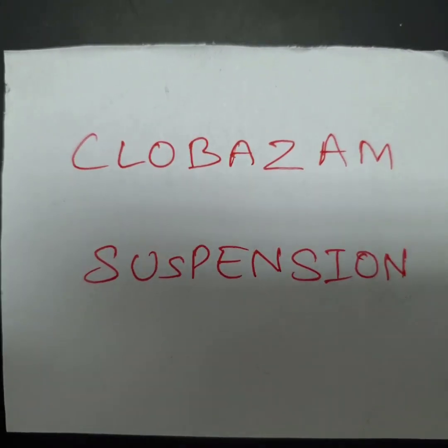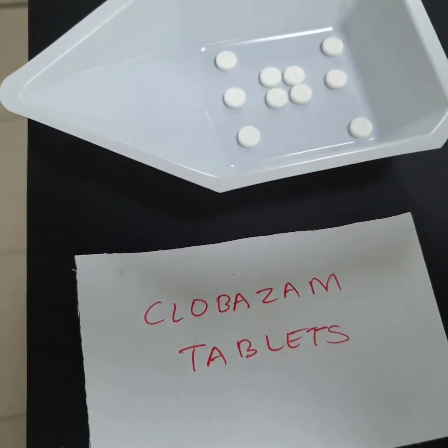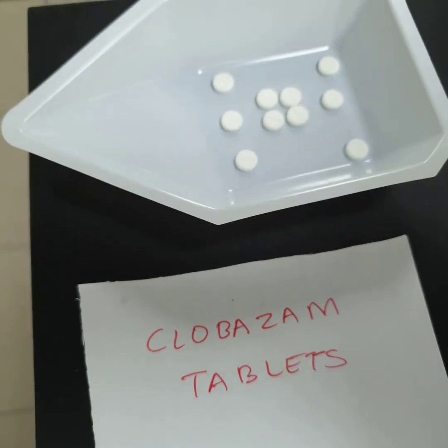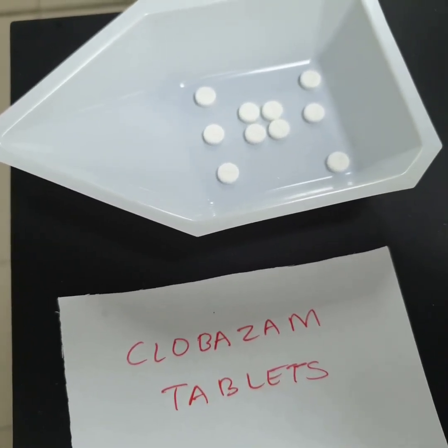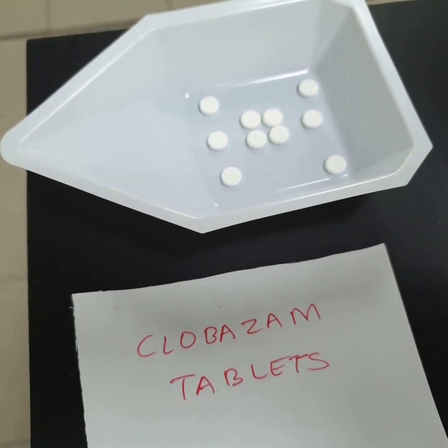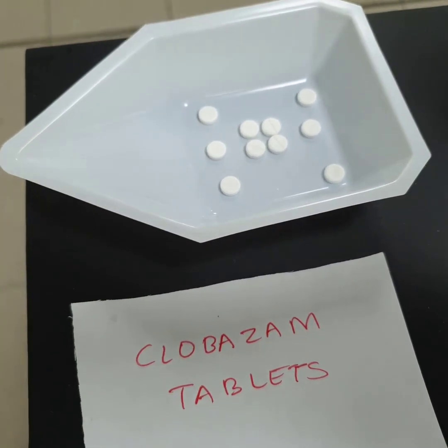Now I'm going to show you all the ingredients, glasswares and tools which are required to prepare clobazam suspension. So first of all, we are going to have 10 tablets of clobazam. One tablet is equivalent to 10 milligram and 10 tablets is equivalent to 100 milligram of clobazam. We are going to use these tablets and grind, crush them, and we will prepare suspension from these tablets.